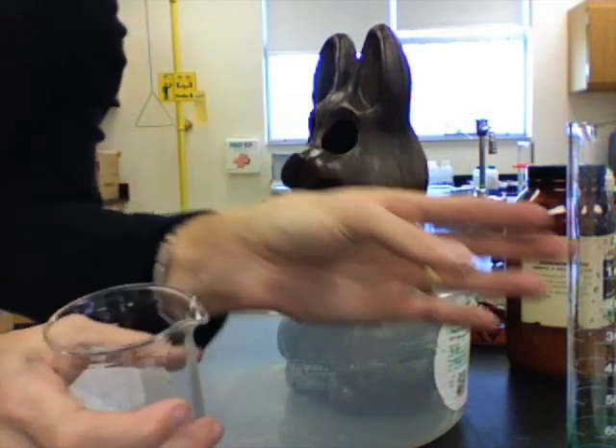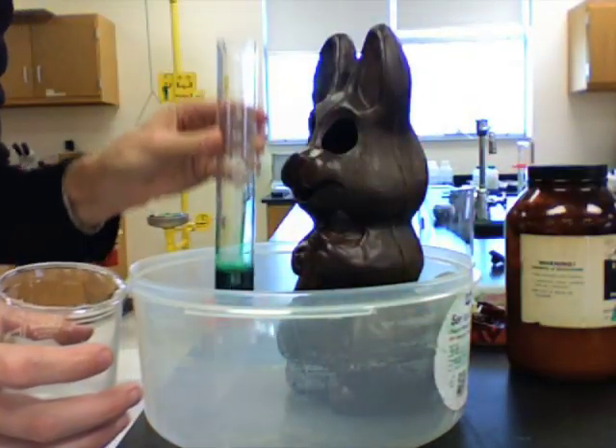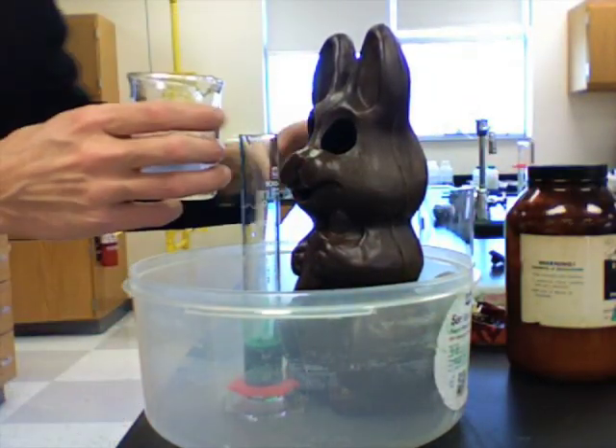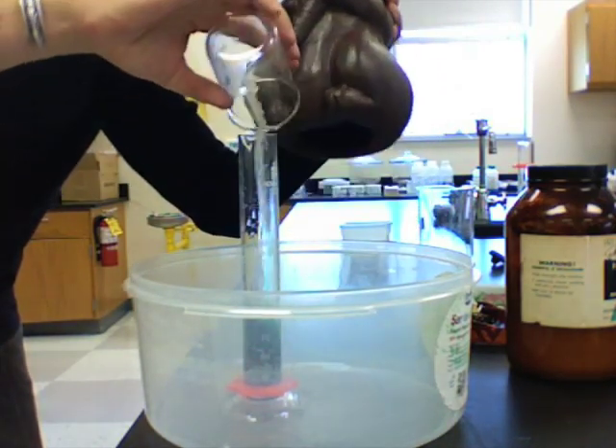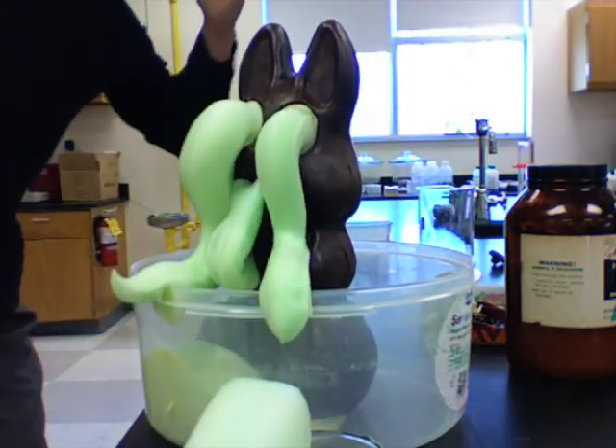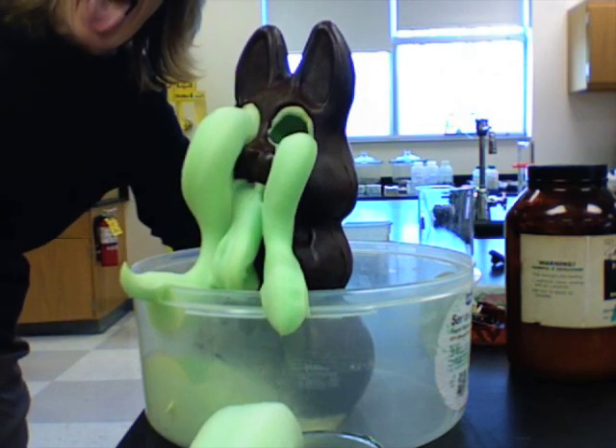So what I'm going to do is take the potassium iodide solution, which is my catalyst, and pour it into the hydrogen peroxide. And I get a decomposition reaction! Holy crap!